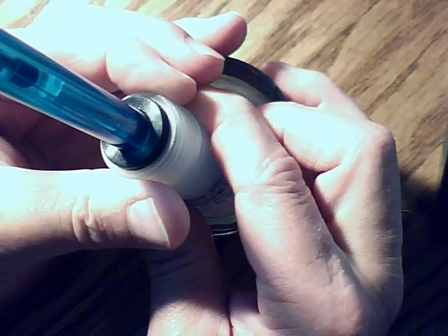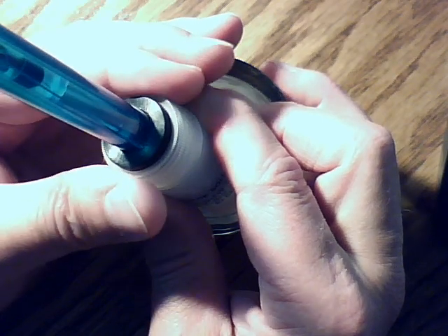You simply lift it up a little bit, loosen the cap — don't take it all the way out, just loosen the cap — just enough to allow some air to seep in around the edges, and pull the pH meter out.